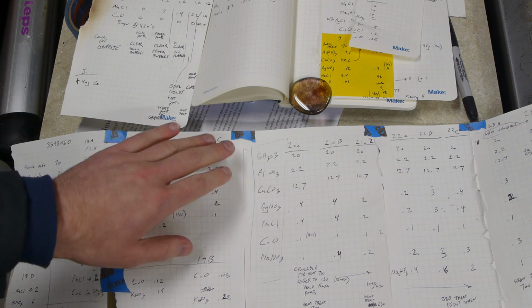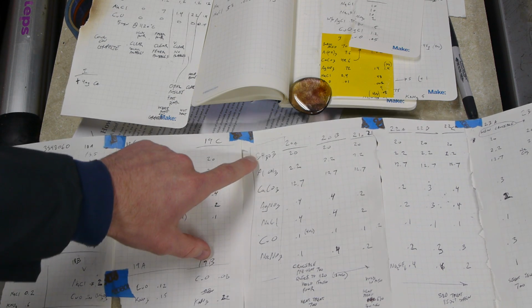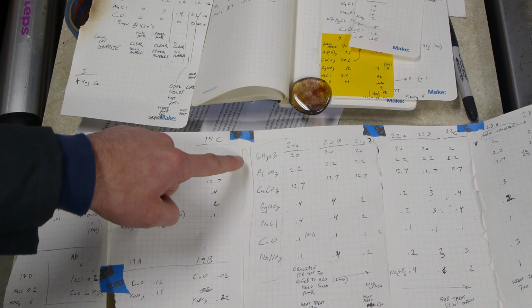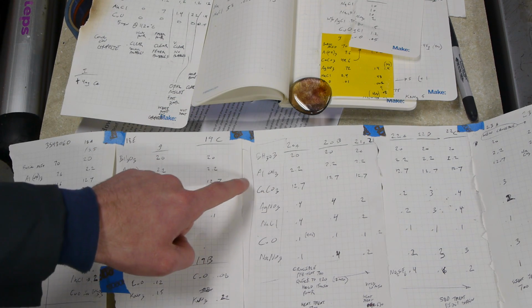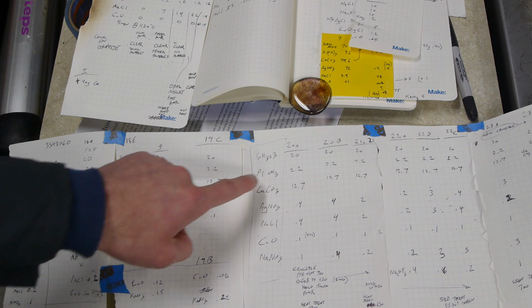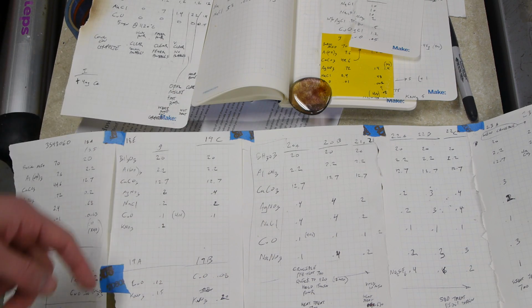This winning combination is a borate glass. There's actually no silica in it whatsoever, so it's not borosilicate, it's just boro, or borate glass. So we've got 20 grams of boric acid. This will contribute B2O3, or borate, in the final glass, and this is kind of the backbone of the whole system. Then we have 2.2 grams of aluminum hydroxide. Now remember, the hydrogen is going to go away at these high temperatures, and we're going to be left with Al2O3, so alumina, which is dispersed among the mixture.